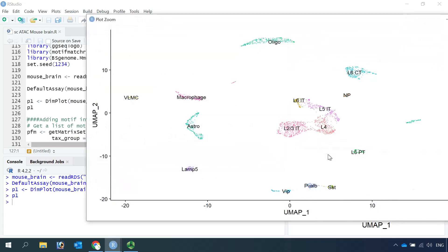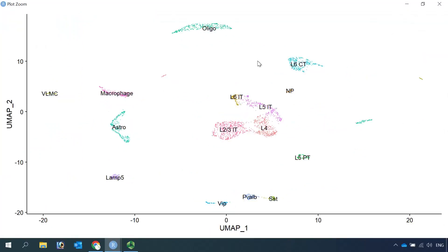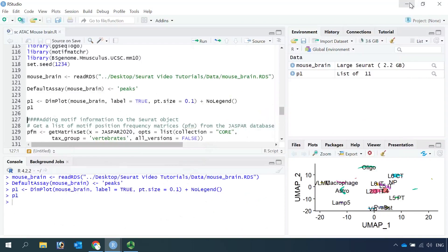Then we can have a look at the cell clusters in this object. Let's zoom in. You can see we have cell clusters for different neuronal populations. We have oligodendrocyte, astrocyte, and microglia/macrophages. So you can see our analyzed Seurat object.